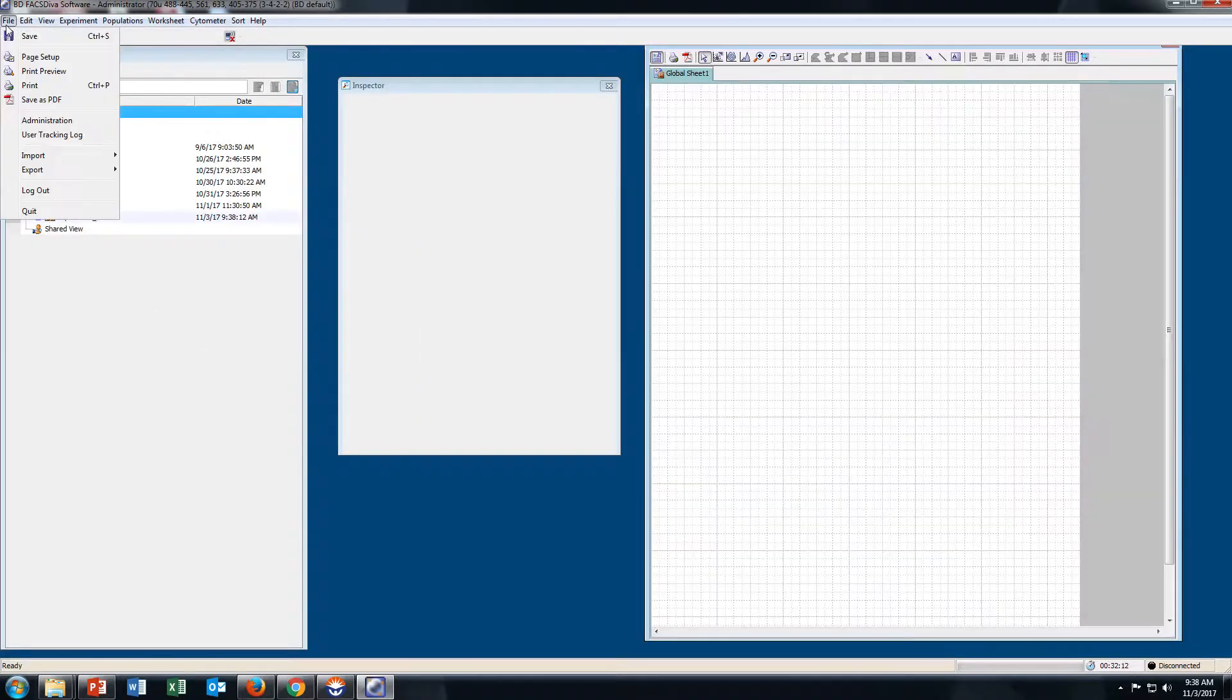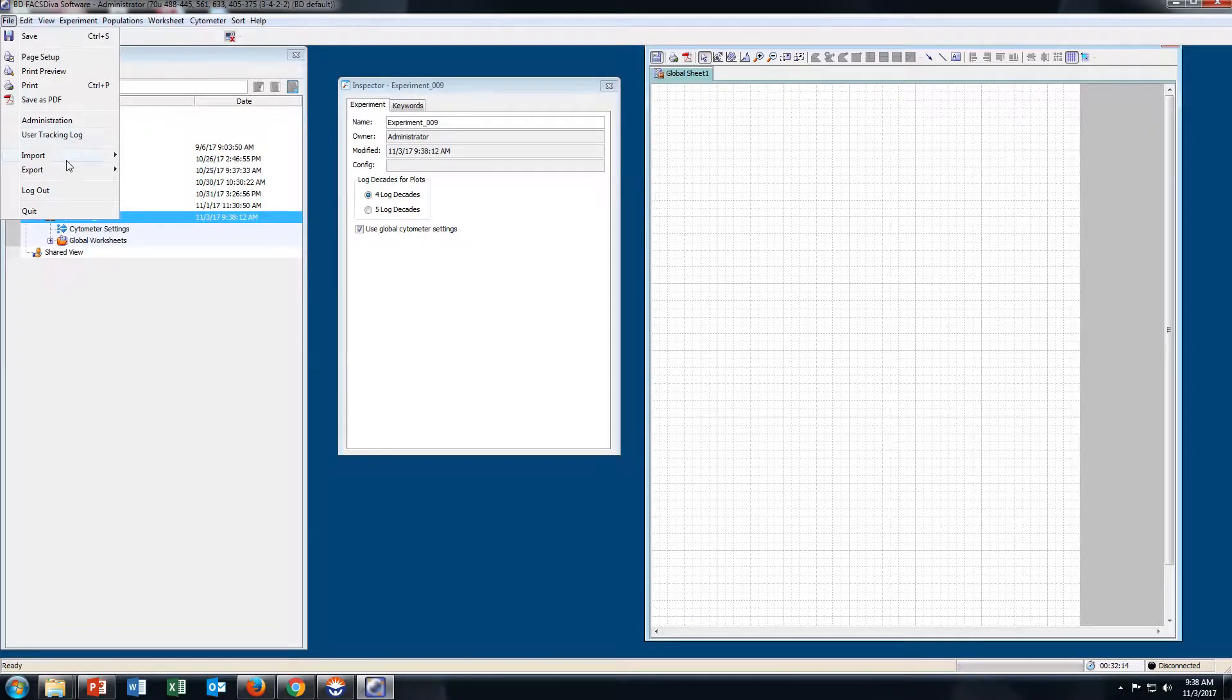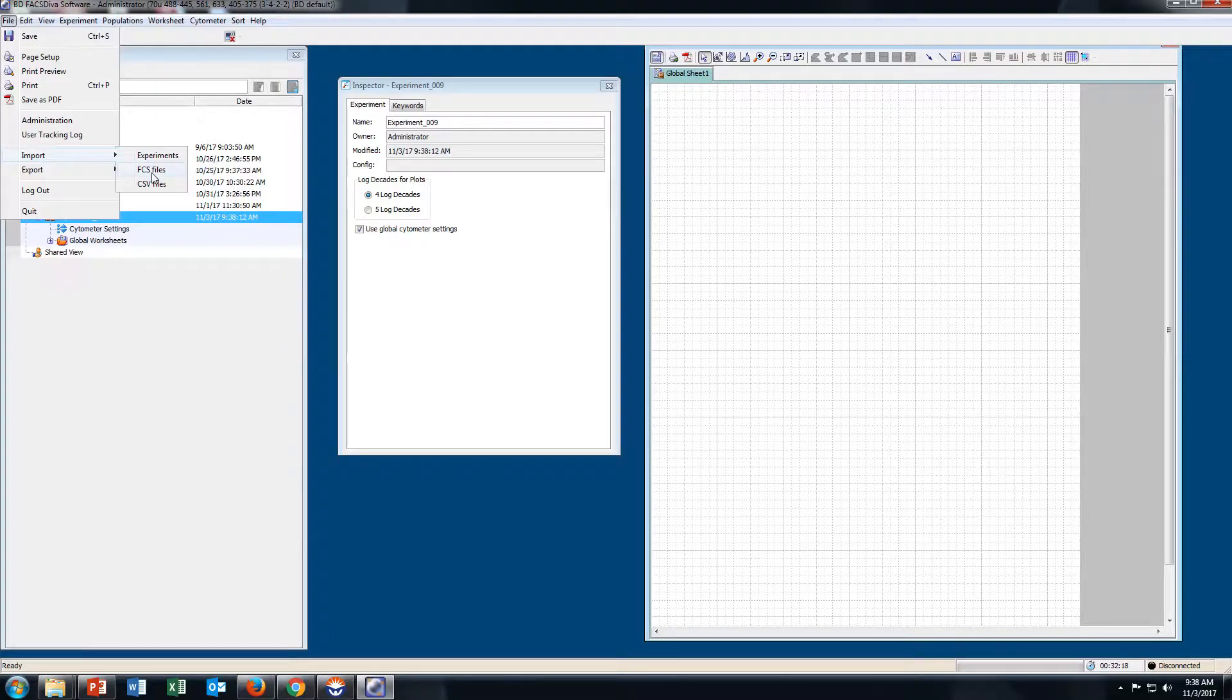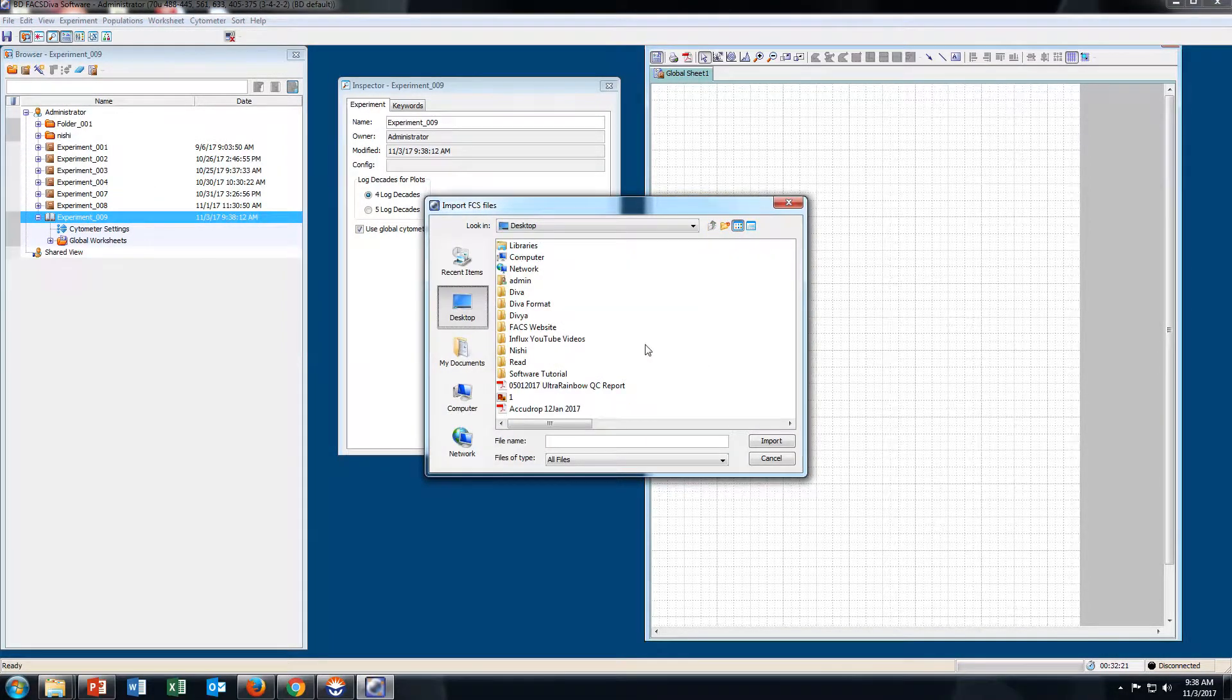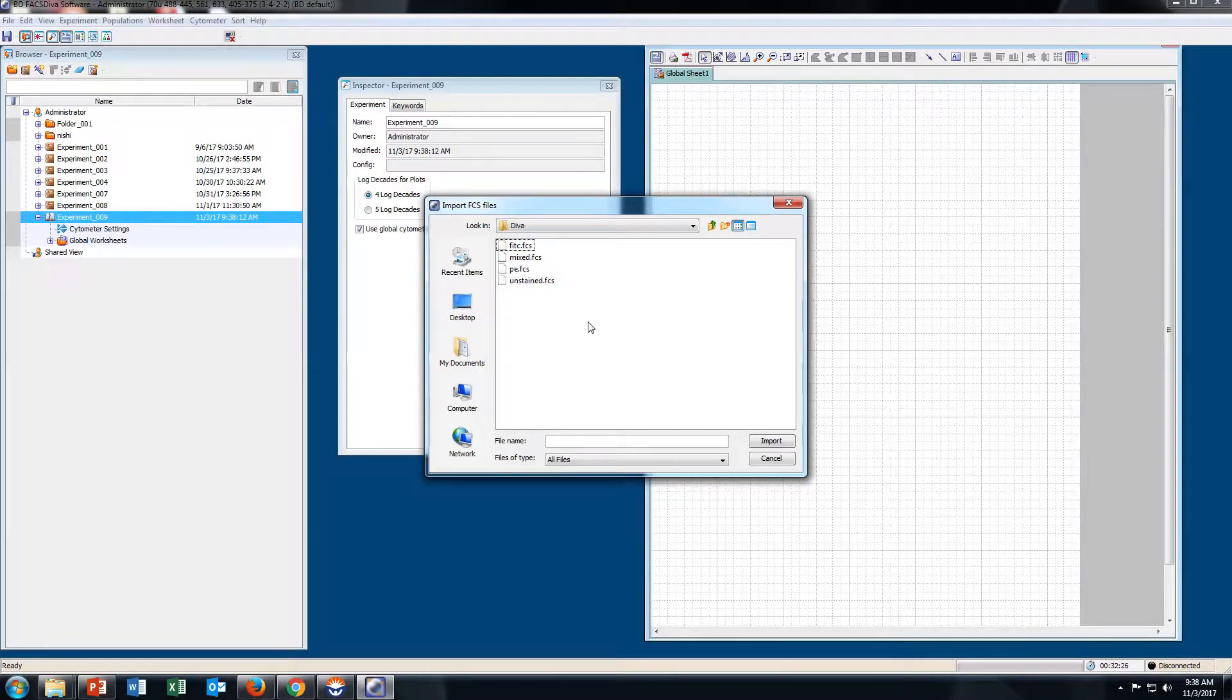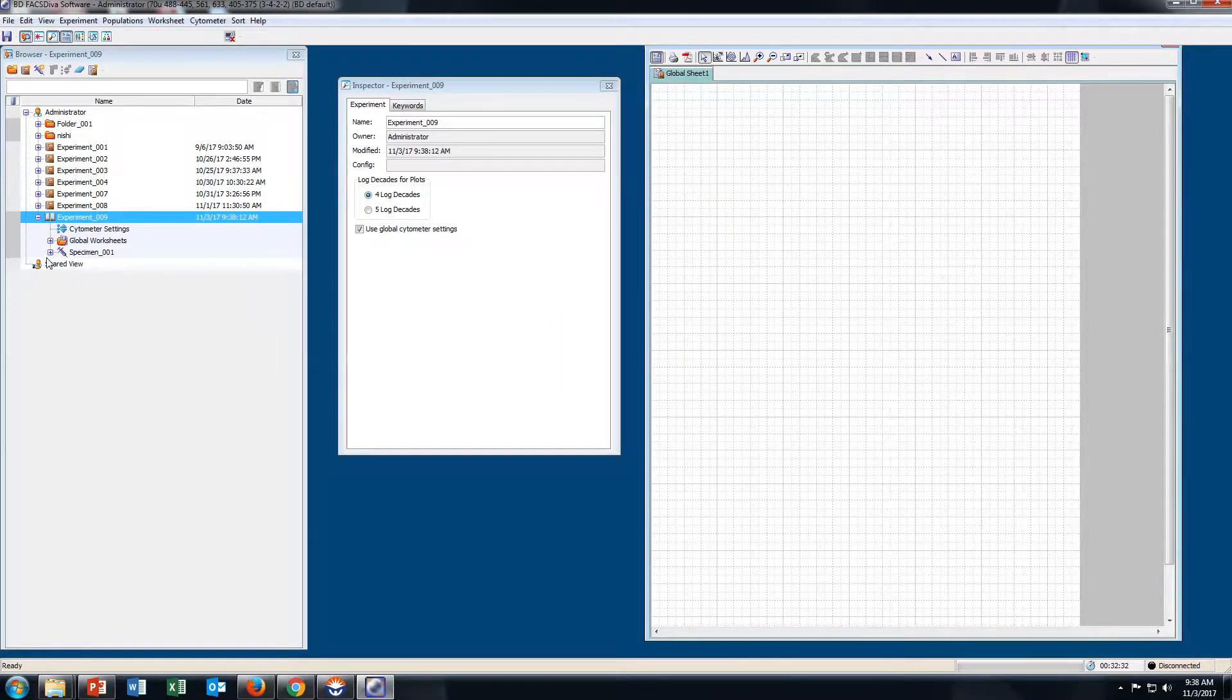Go to File and import FCS files. The saved FCS files are here. Select all of them and import. Click OK.